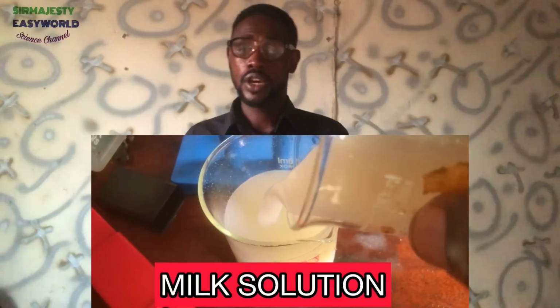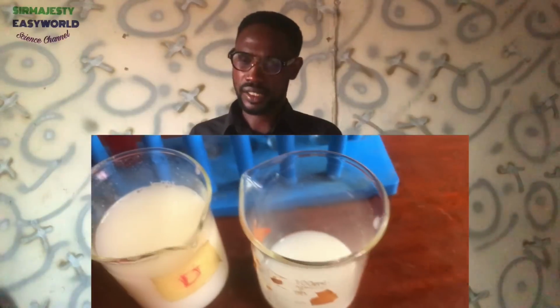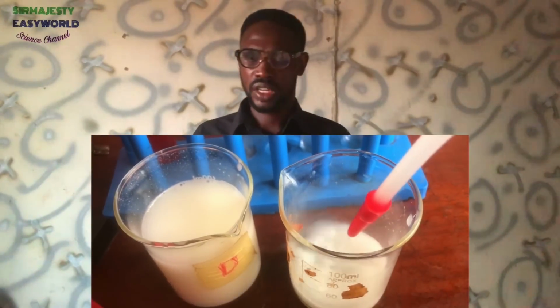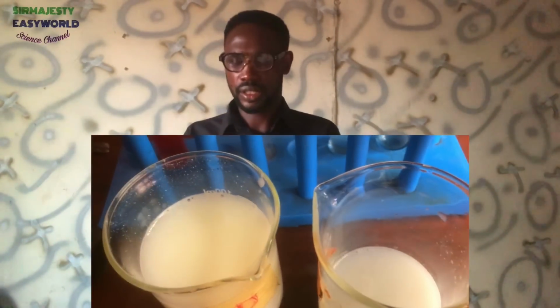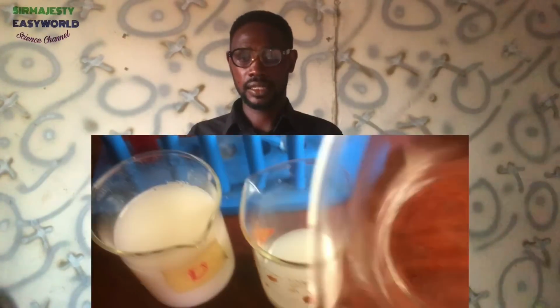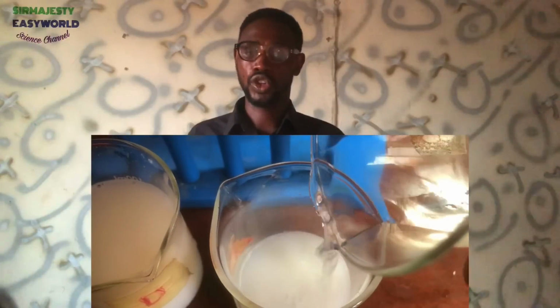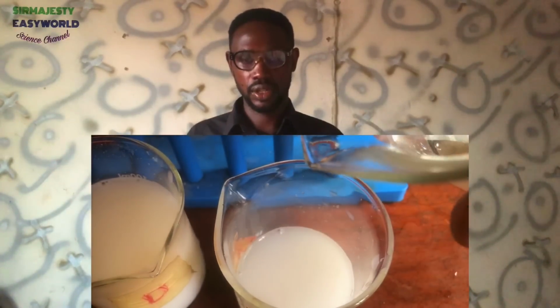We go to milk. We were provided with soda lime and 2 molar HCl and milk solution. Now let us coin the exact thing that will come here. You will be told to add that 2 molar solution HCl to milk. That will lead to what we call coagulation, as you can see there on the screen.